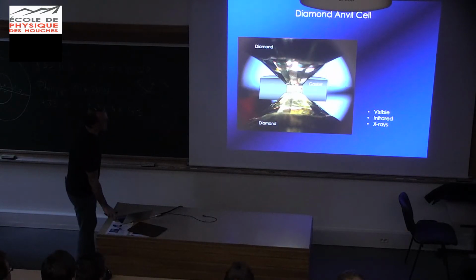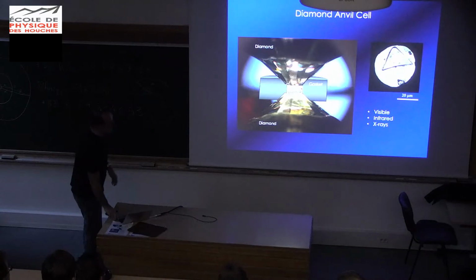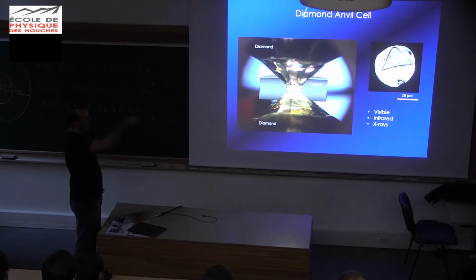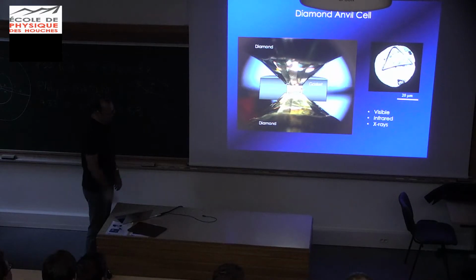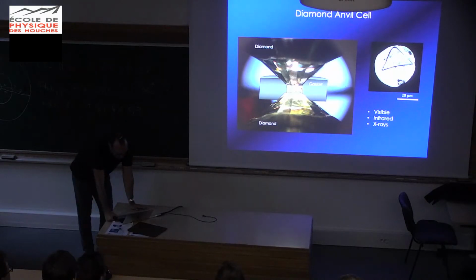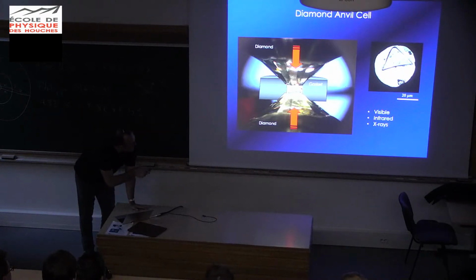What's interesting with diamond is that it's transparent. It's not like tungsten carbide, right? It's transparent to a wide range of radiation. It's transparent in the visible. You can see through it. Here, you're looking at that sample through the axis of the diamond. You light it from below, and you look through a microscope from the top, and that's what you see. Also, it's transparent to the infrared and to X-rays. So you can use all these radiations to probe your samples in situ, which is impossible to do with the other techniques, okay? So you increase the load on the diamonds, this thins down and pressure increases.